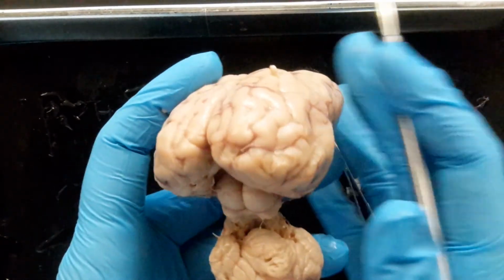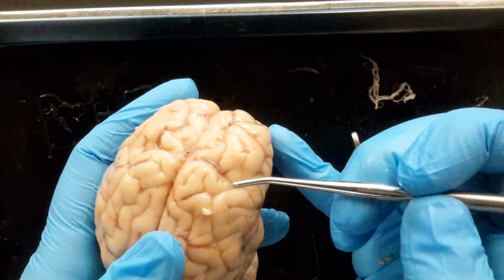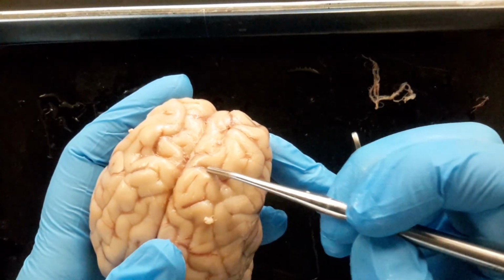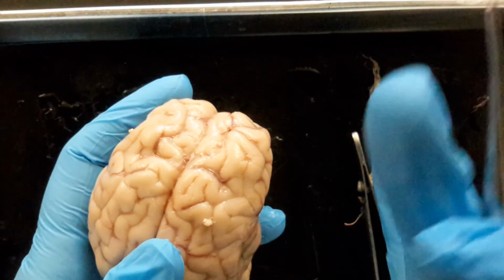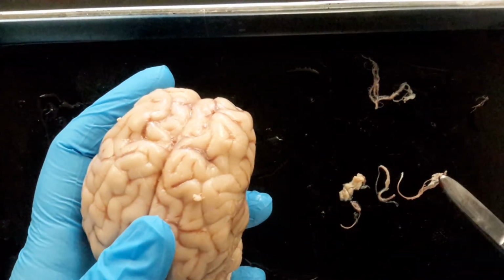So clean away some tissue, and I'd like for you to at least get a little portion of the cerebral cortex clean so you can clearly see a nice sulcus and gyrus, okay? So have a little bit of fun with your probe, okay?